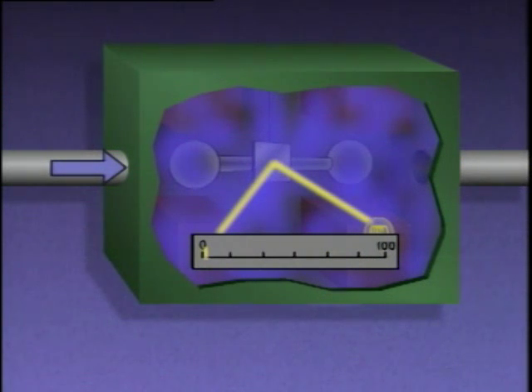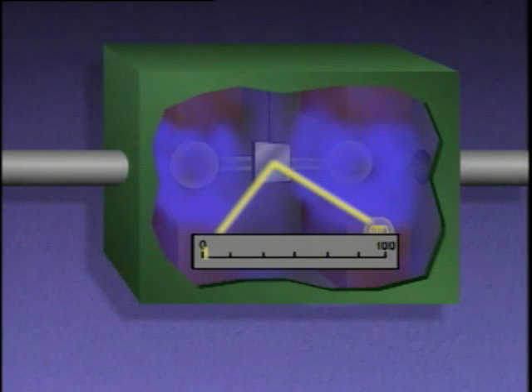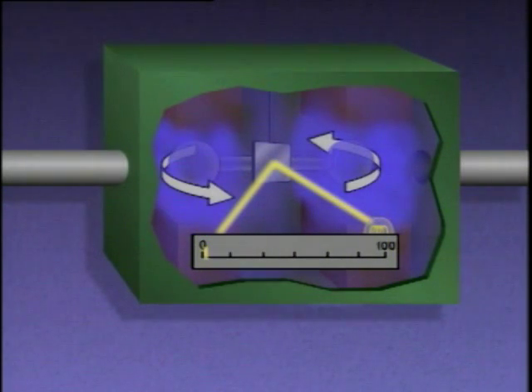During operation, the gas being measured enters through the chamber's inlet. The oxygen in the gas is attracted to the centers of the magnetic fields and tries to force the spheres of the measuring device out of the magnetic fields. Thermal conductivity is the ability of a substance, such as a gas, to conduct heat. The operation of a thermal conductivity gas analyzer is based on the fact that different gases have different rates of thermal conductivity.